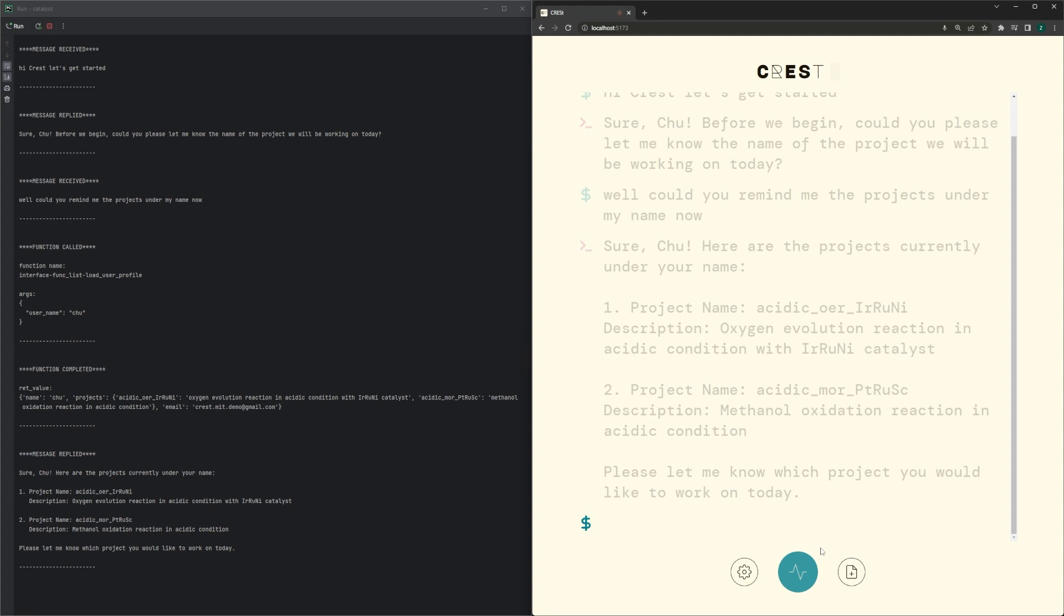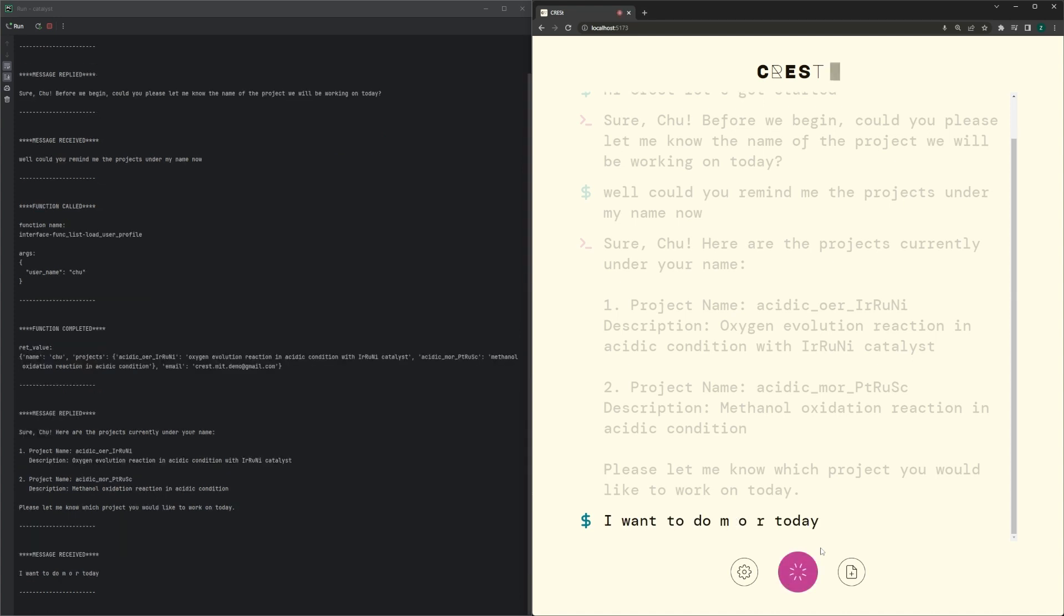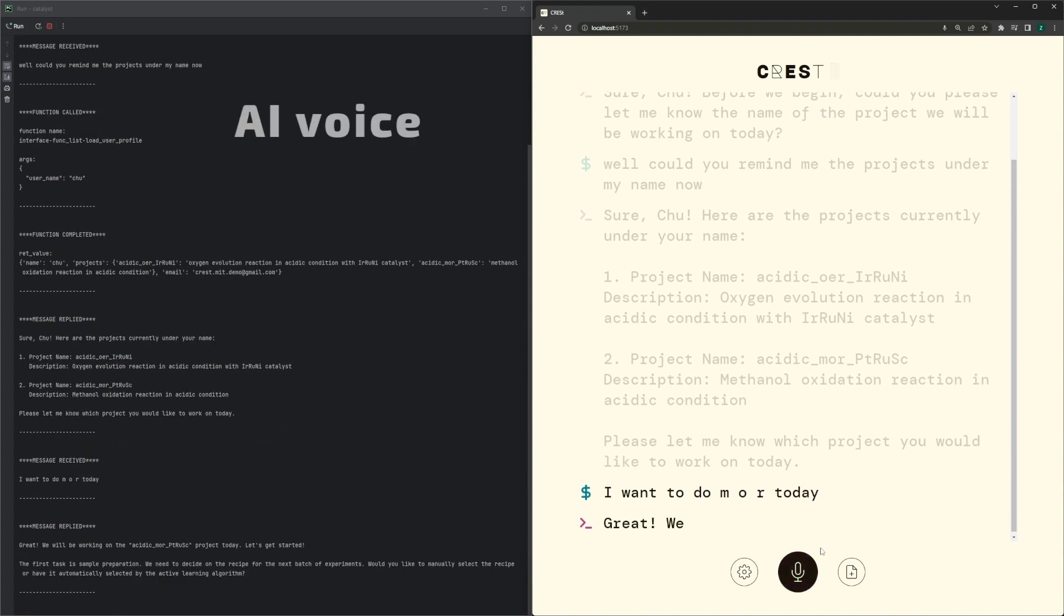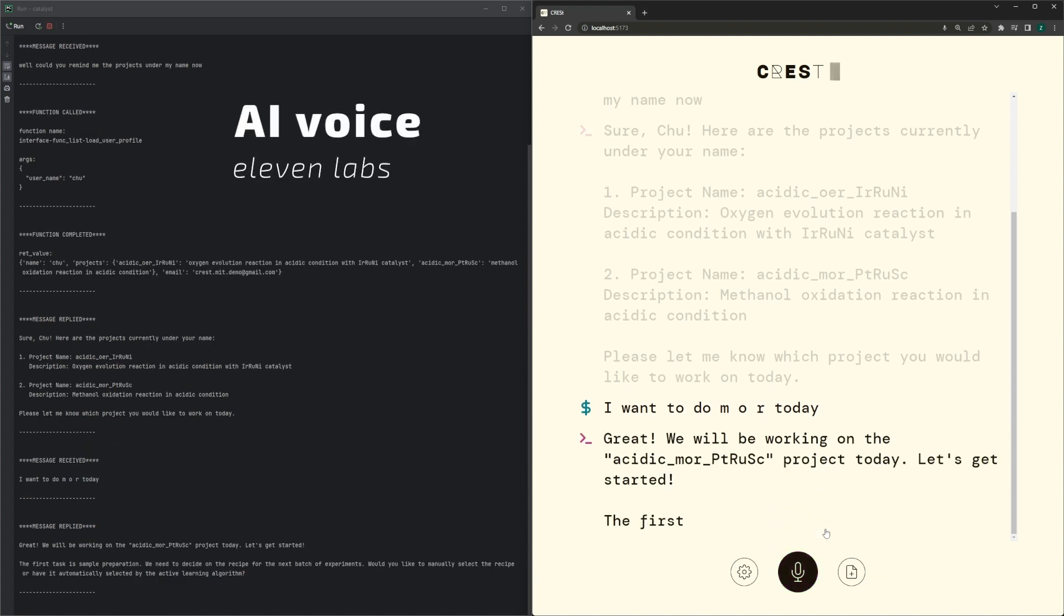I want to do MOR today. Great! We will be working on the Acidic MOR Platinum Ruthenium Scandium project today. Let's get started.